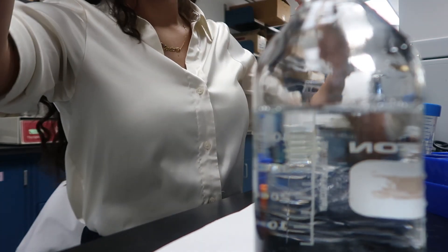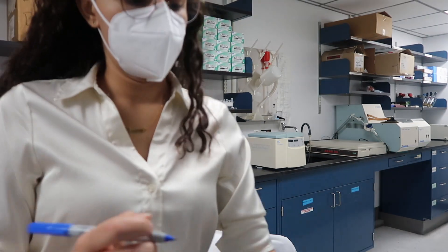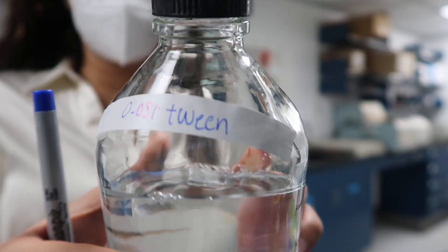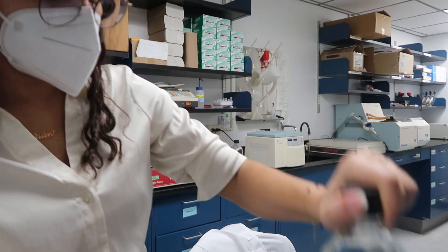I have to mix it up a little bit so it all becomes homogenous, but you can't make bubbles. Now we got to label it so everyone knows what it is. It's leaking — yikes.